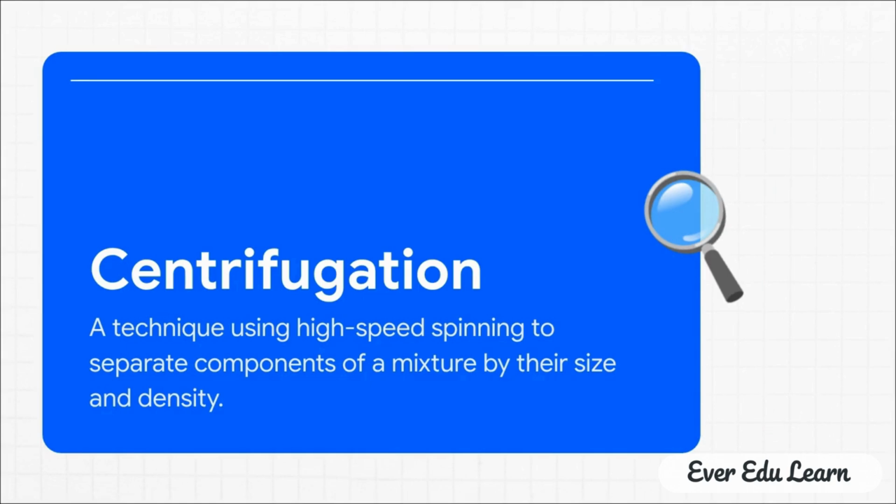This technique is called centrifugation. You take your blended up cell soup and you spin it at incredible speeds. Just like when you spin a wet towel, the heavy stuff gets flung out. In the cell, the heaviest parts, like the nucleus, get packed into a pellet at the bottom first. You can then pour off the liquid, spin it even faster, and the next heaviest stuff comes out.